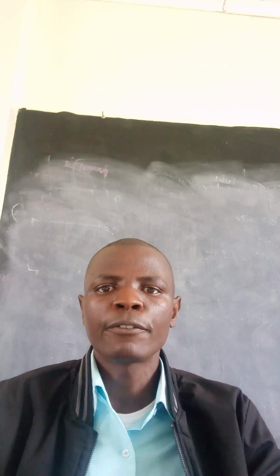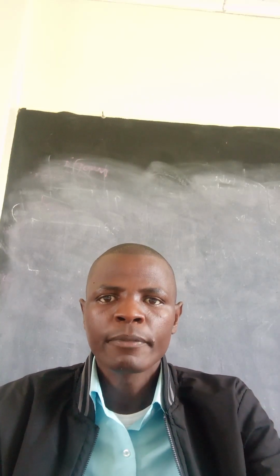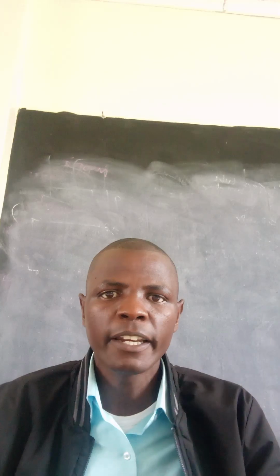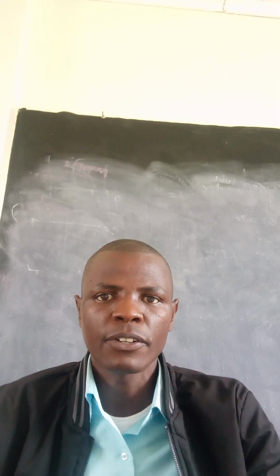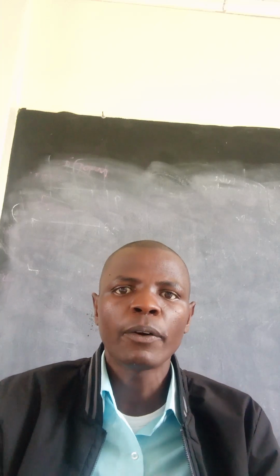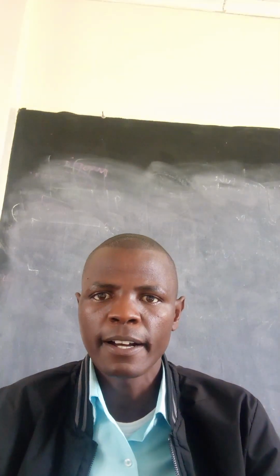The mirror reflects light to the stage, but that light passes through the diaphragm, then the condenser, before it reaches the stage and illuminates the specimen. So the diaphragm regulates the amount of light, the condenser concentrates the light, and the mirror reflects light to the stage through the condenser.